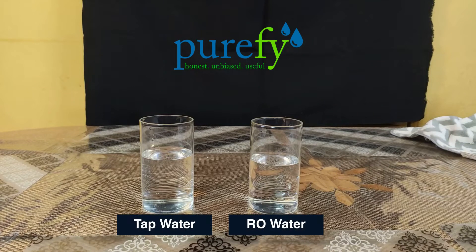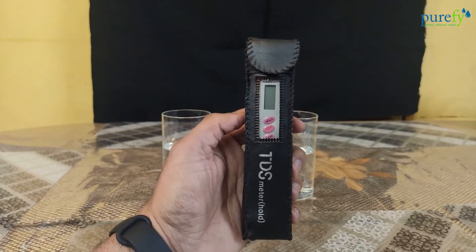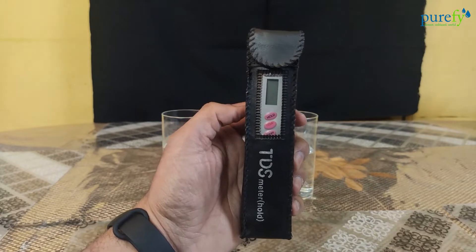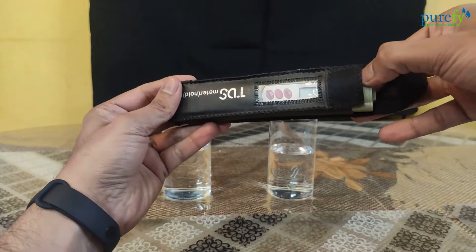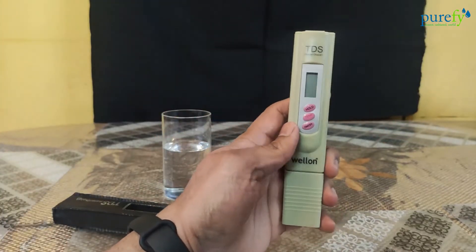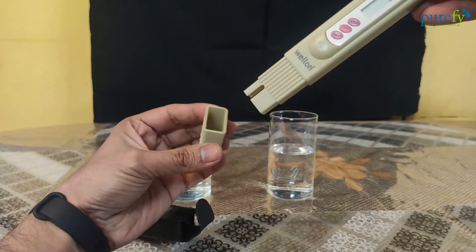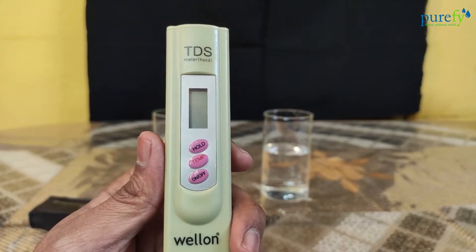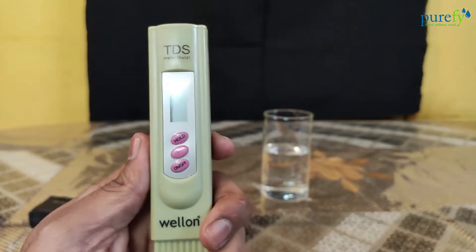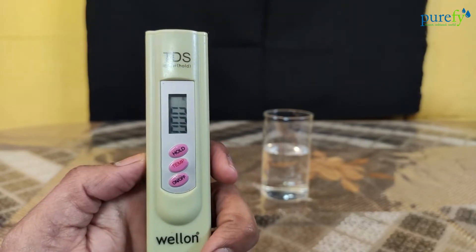We have two glasses of water — one with tap water and one with purified RO water. For measuring the TDS level of these water samples, we will need a digital TDS meter. For today's video we'll be using a digital TDS meter from a brand called Wellon. We bought this from Amazon for just rupees 250. You'll find a lot of TDS testers online with the same design and features — all are Chinese products and Indian importers have just put their brand marks on them. We've provided the Amazon link in the video description.